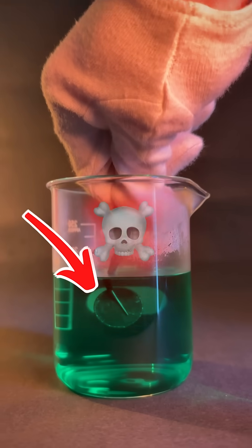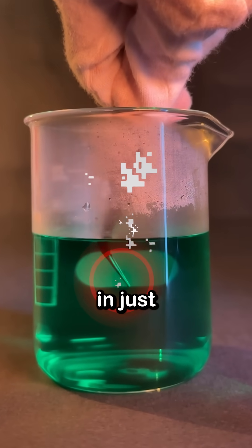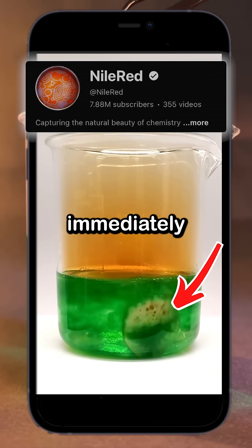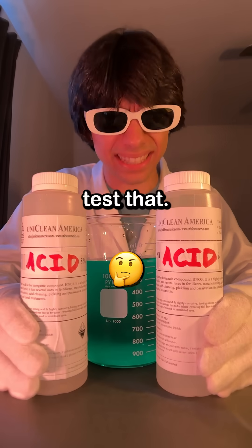If you drop a penny into this deadly acid, it'll dissolve completely in just one minute, according to this video. If I put a penny in, it immediately starts eating it. But I'll want to test that.